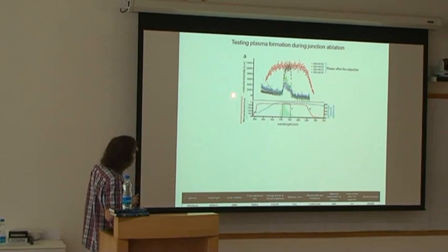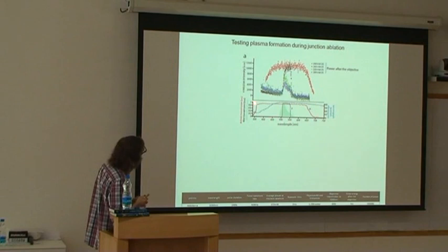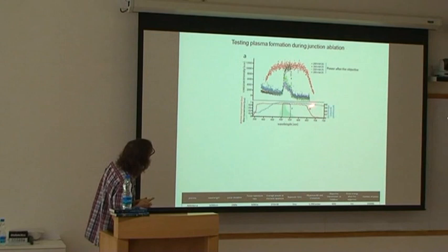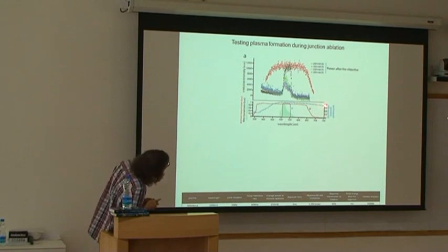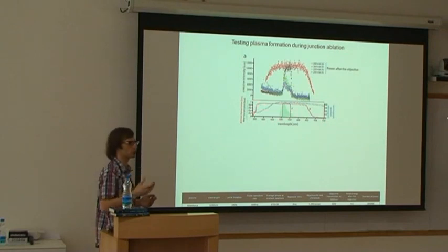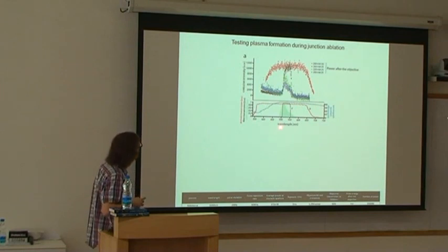It was very interesting. What I'm showing here in this graph below, in green, is the emission of GFP. So you have the wavelength, and this green stuff is the GFP. All the other stuff is filters that I had in there. This one is the quantum efficiency, I think, of the spectrograph in blue. Then this is another dichroic that I had, and this was a filter that helped me to visualize the junction. So this is then what I collected with the spectrograph.